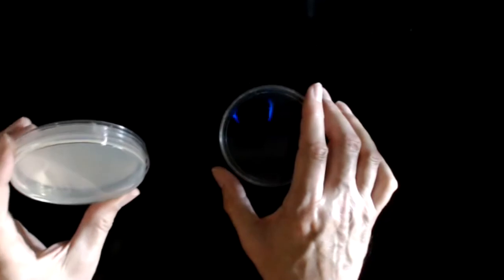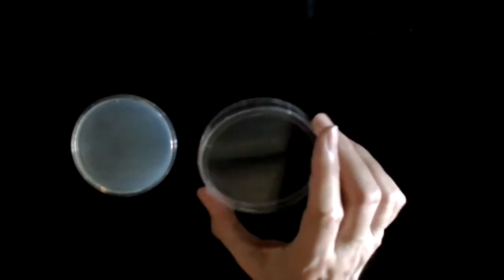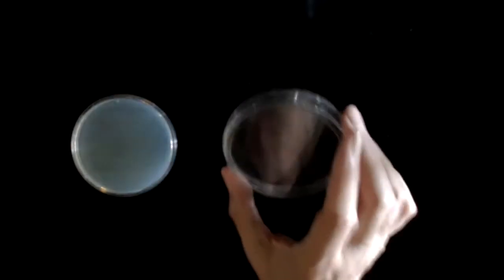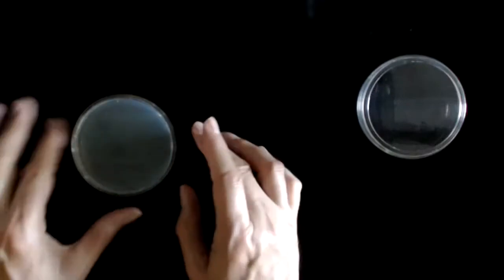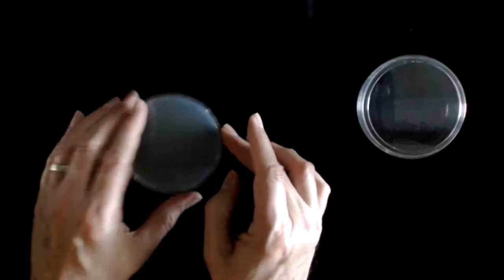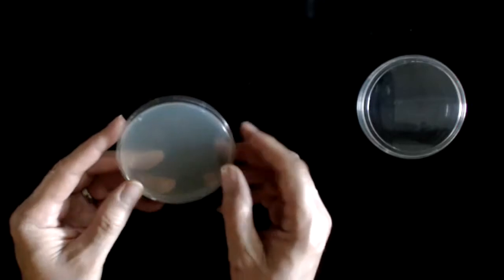You'll notice that in the lighting that we have here, the plate in my left hand looks a little bit cloudy, and the empty plate in my right hand is clear with no cloudiness and no color. Again, this is clear and colorless because it doesn't have anything else in it. But if you pour something into the plate, something we call an agar, and the agar solidifies, it usually solidifies and at least appears slightly cloudy.